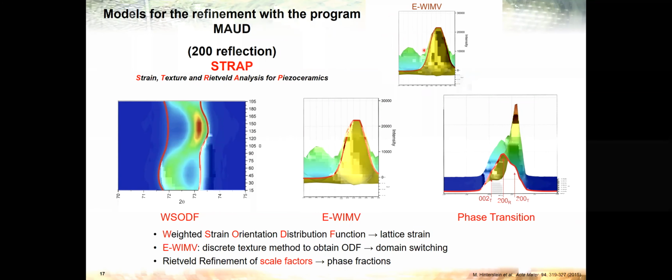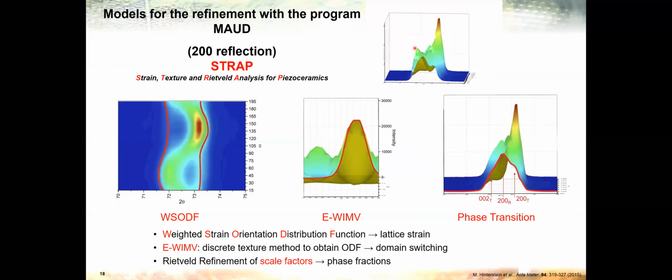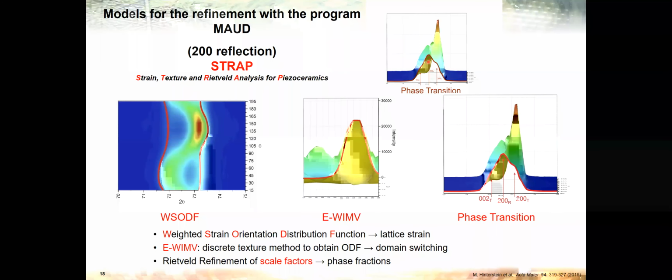And we have a texture model where, at the different orientations, we can see these changes in reflection intensity. And here is now magnified this special 45-degree angle where you have the additional rhombohedral reflection.